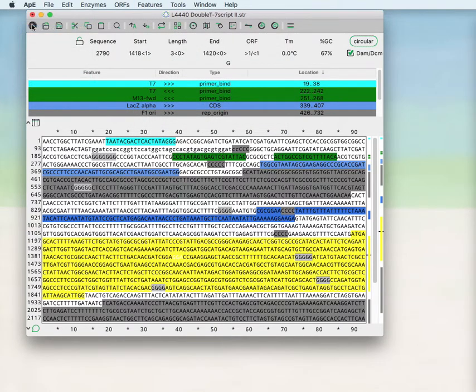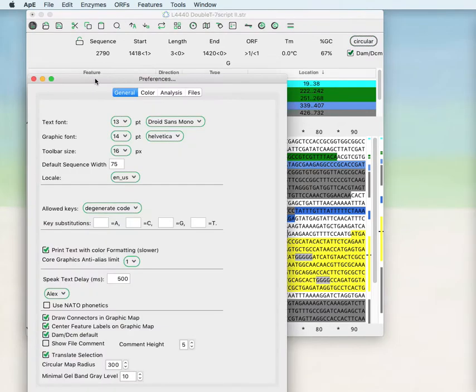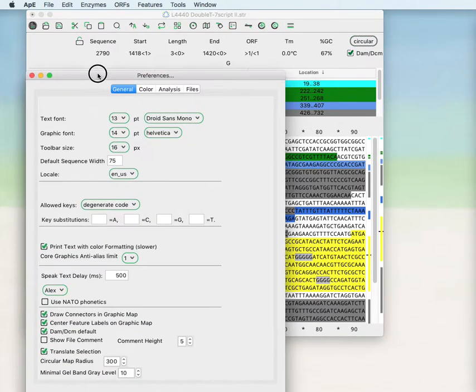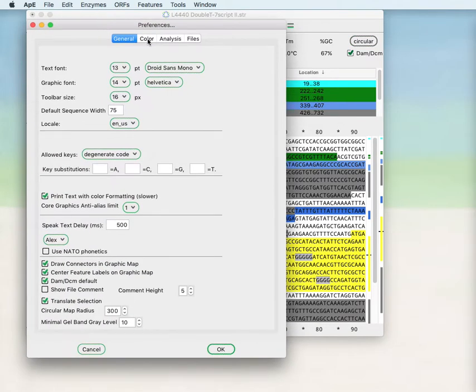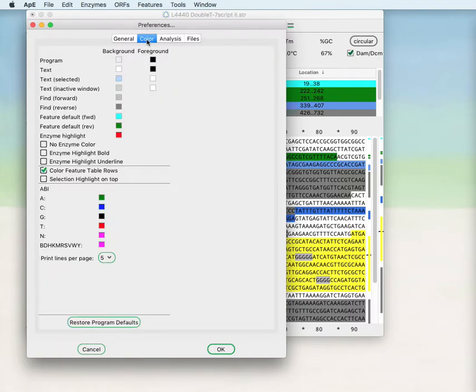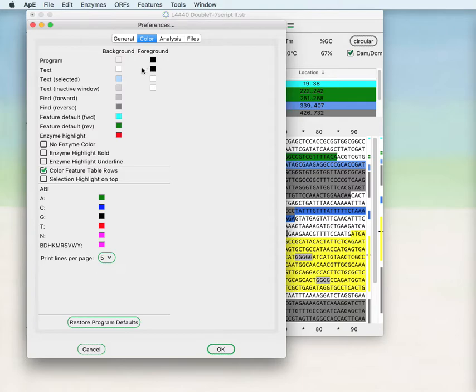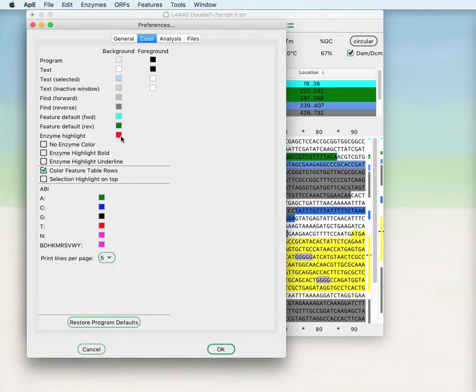You can change the colors that those are highlighted in by changing the colors within the preferences. Also within the preferences you can change all of the current text foreground and background, the selection foreground and background, as well as enzyme highlighting, which we will talk about in a later time, the default feature colors.